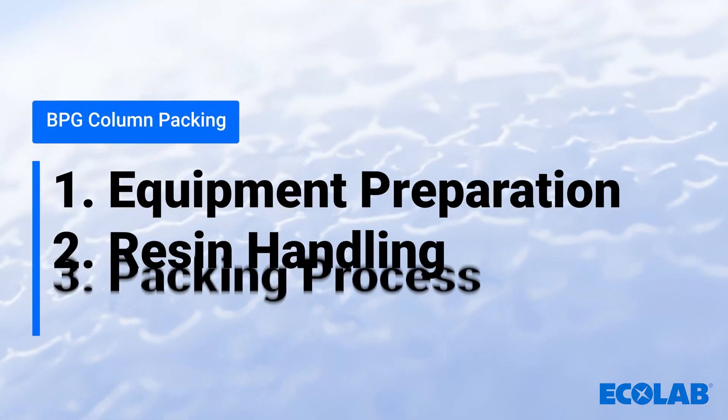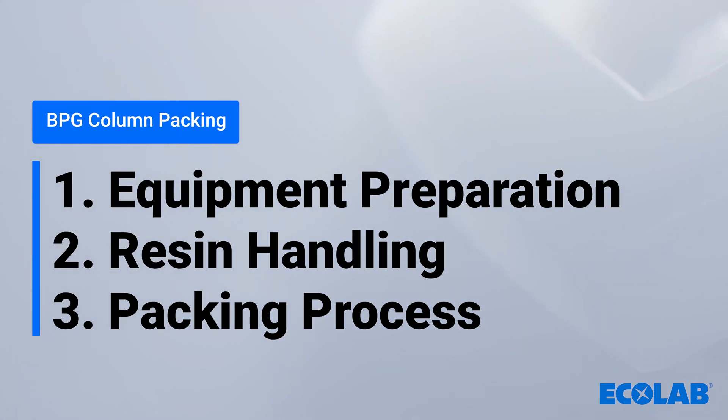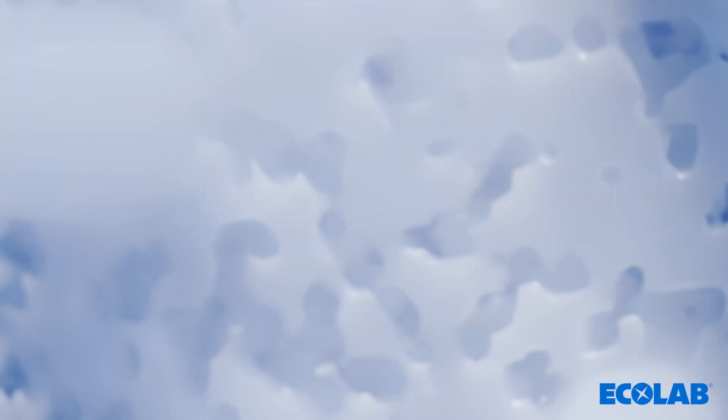We'll be focusing on techniques to ensure uniform packing and maximise column efficiency, covering everything from equipment preparation and resin handling to the actual packing process. Whether you're new to column packing or looking to refine your technique, this video will provide valuable insights to help you achieve consistent and high-quality results.